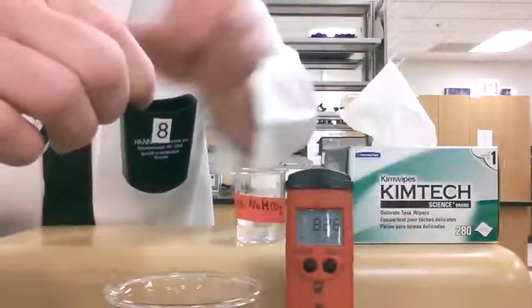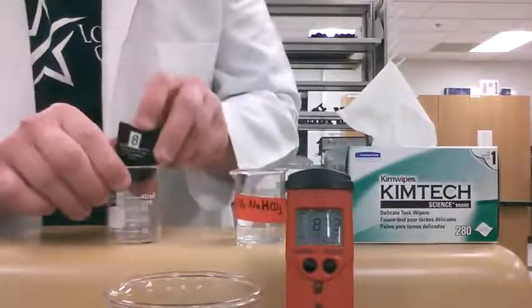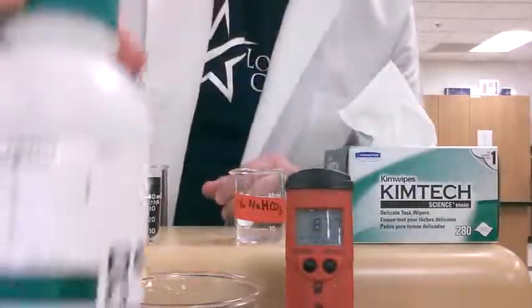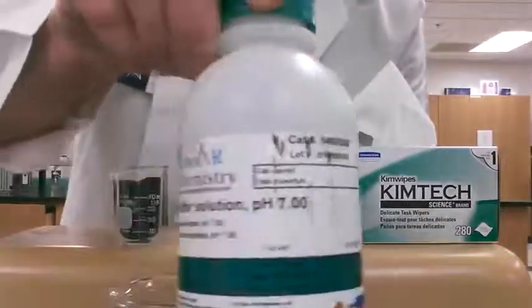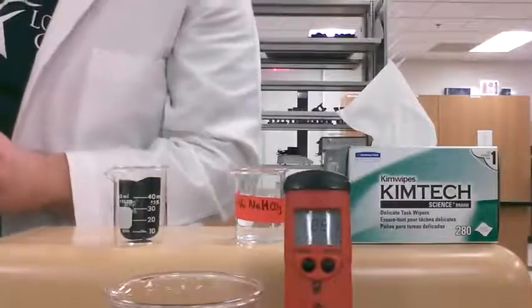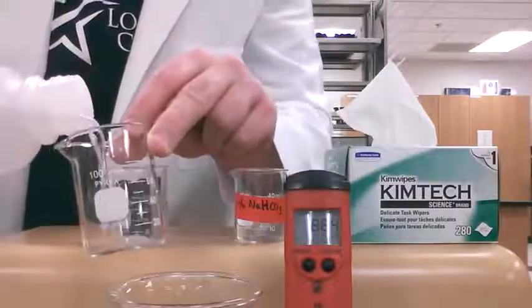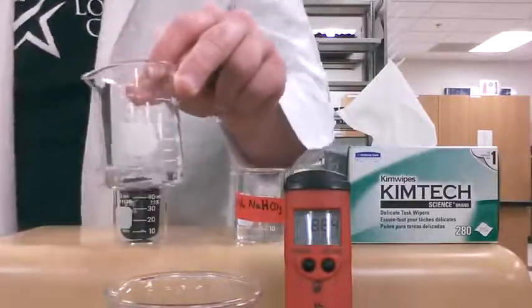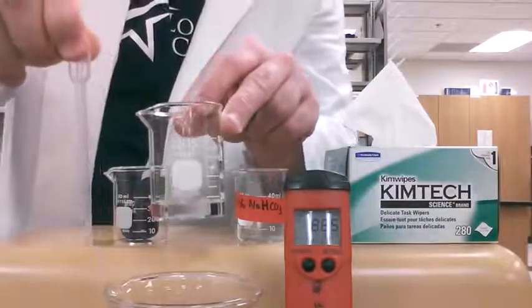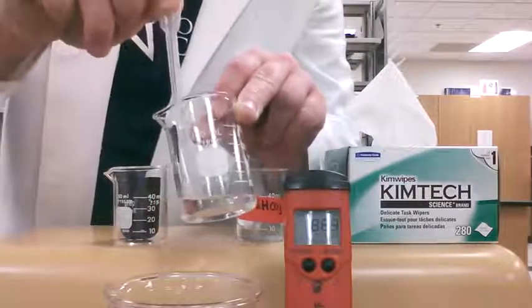We're going to set the pH meter to the side and take some pH 7 buffer — that's this right here, a pH 7 buffer solution. We're going to pour a little bit into a beaker, and after we've poured some in, we can take our plastic disposable pipette or dropper and suck some up.